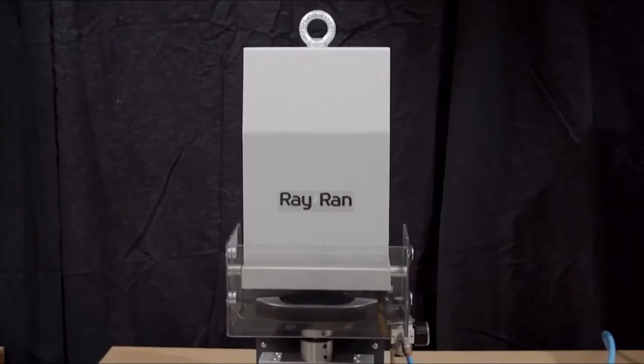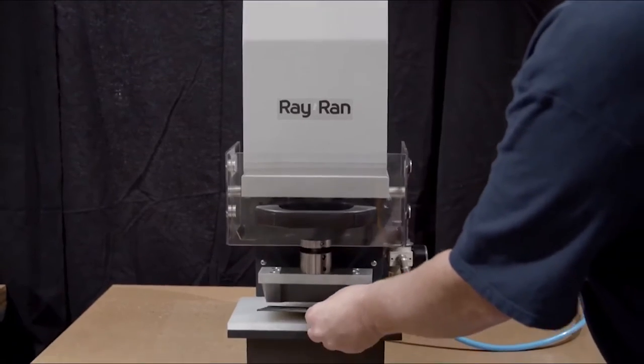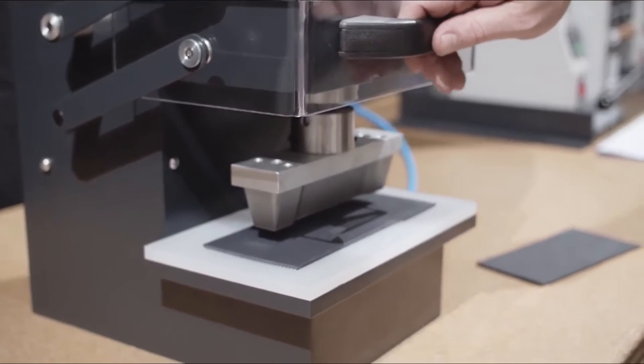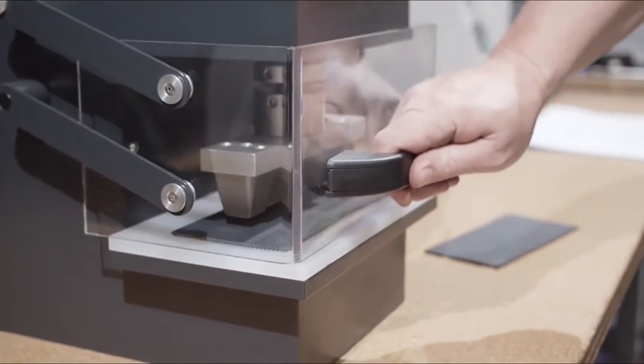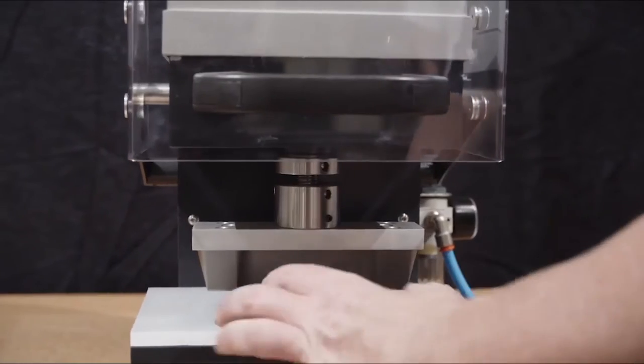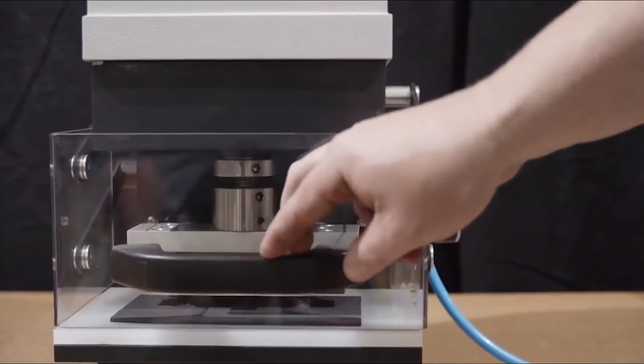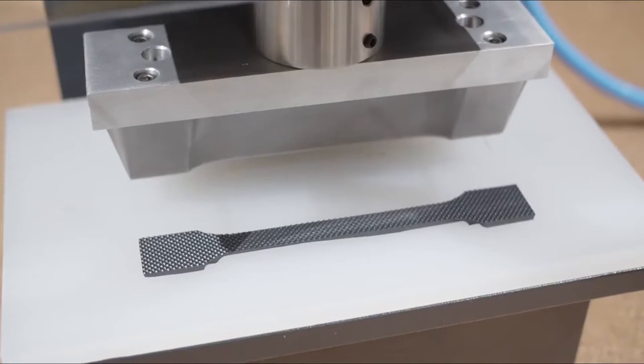On display at the lab is the pneumatically operated cutting press. Providing an easy and safe way to cut samples, it generates a cutting force of up to 50 kilonewtons to cut materials up to 8 millimeters thick. Cutting dies are interchangeable and easy to switch out. Custom dies can also be fabricated to meet your specific needs.